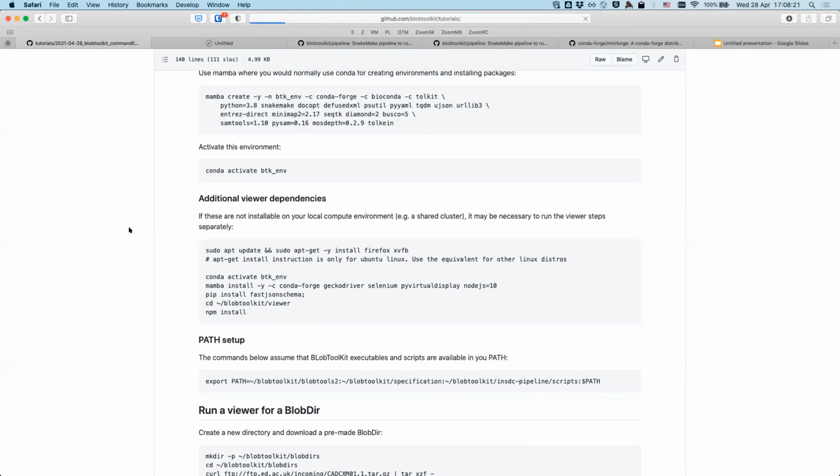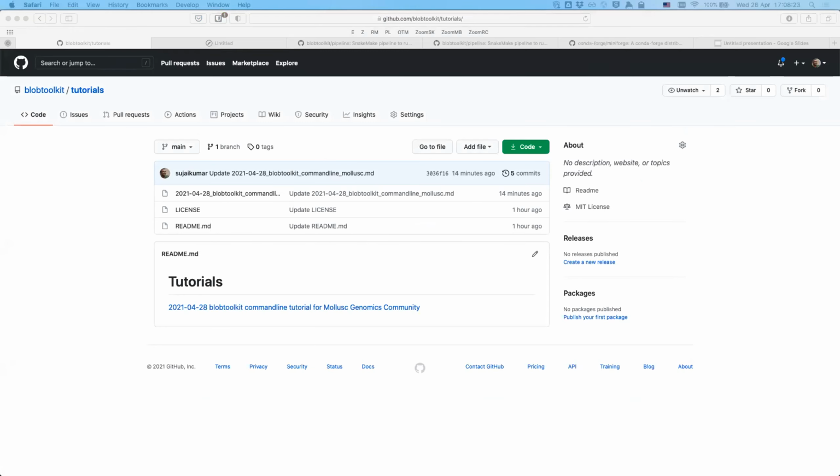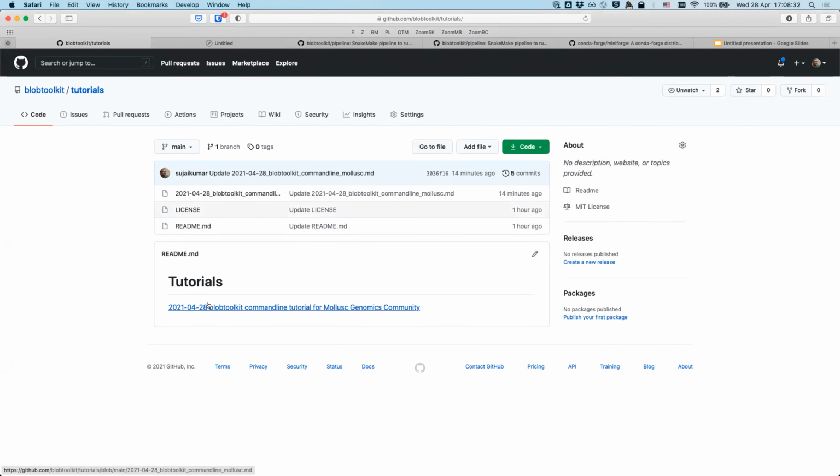Okay, so I'm on the tutorial, and Alice, can I ask you to keep an eye and see if people are giving thumbs up and tell me to wait? Yeah, people seem to be. Thanks. Okay, so the first tutorial is today's on that link. I don't think you can see my screen. Can you see my screen? Yeah, you're good. Okay, cool.